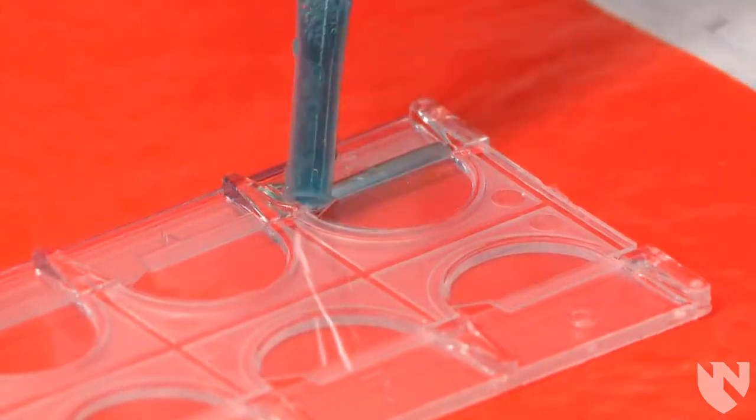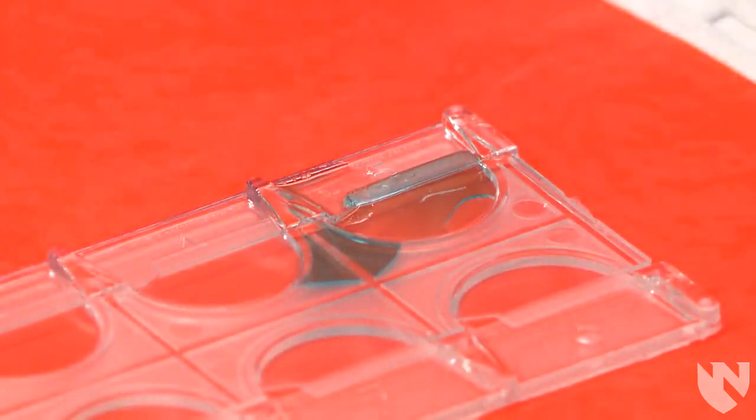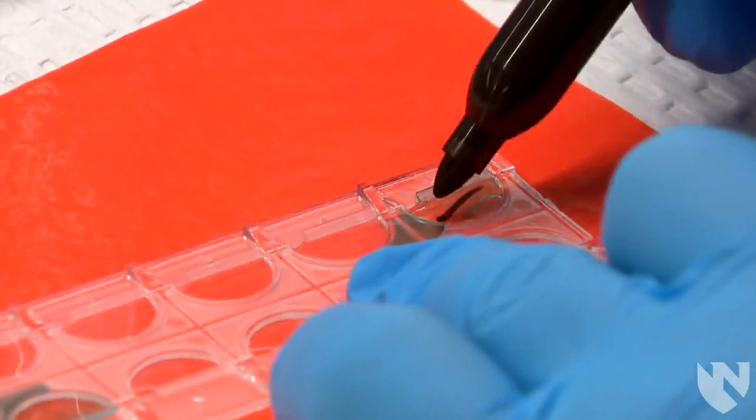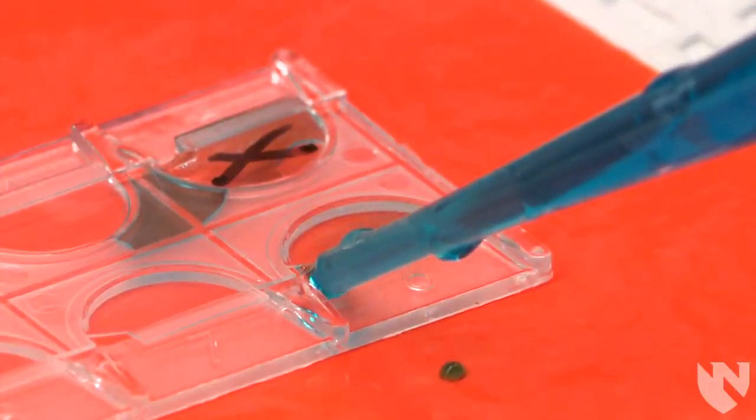If we get any bubbles in our well, we cannot use that well because we no longer have the standardized amount of urine. We would then use a marker and either make a slash or an X to indicate that well cannot be used. Next, we would load the sample into a new well.